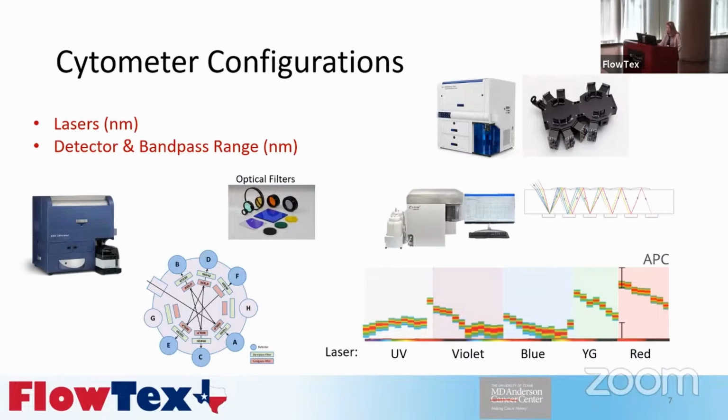I'm showing a couple of examples here where you can see what some of the conventional cytometer detector arrays are. All of your light is typically separated by optical filters, which are just coated glass filters that allow light through at a defined wavelength. Then there are now spectral cytometers. This is the BD A5SE, which uses these modified arrays similar to their octagons. These are cascadagons, I believe they call them. And this is the Aurora, which is a big market player as well, and uses a slightly different detector array using APDs to separate that light out.